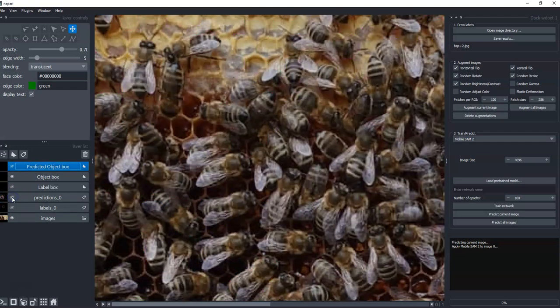We have SAM predictions, and I've been testing SAM a few months, and from what I've heard from other people, it's spectacular for annotations, because SAM needs a prompt. When you're annotating, you form a prompt by pointing at something or drawing a box around it, but SAM is much trickier when trying to process an entire image.